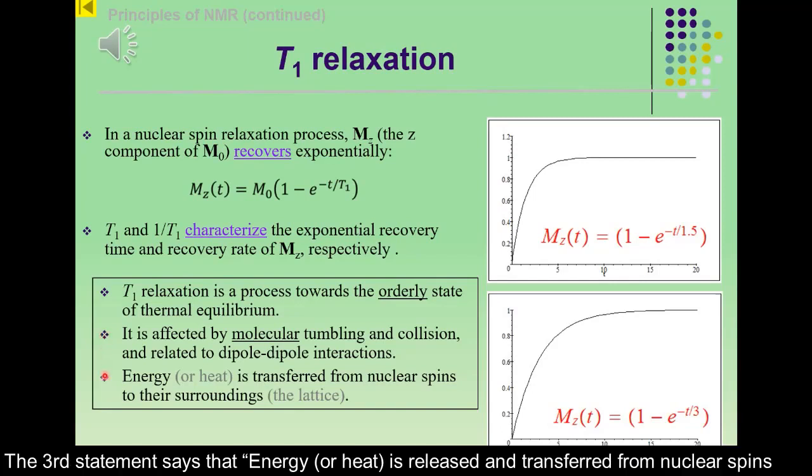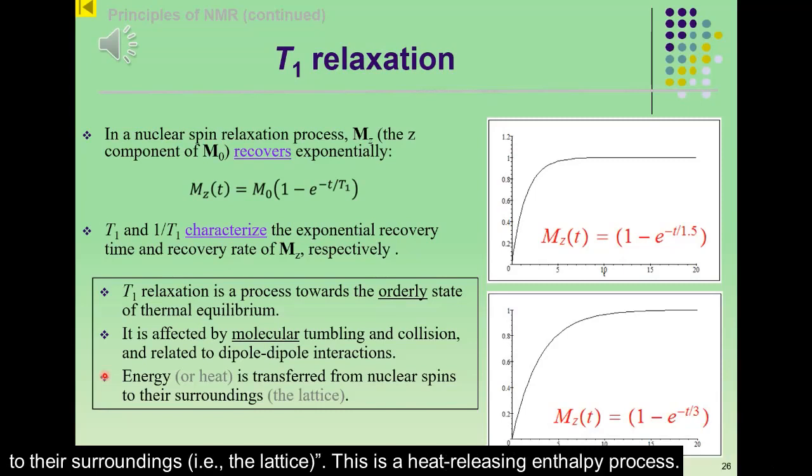The third statement says that energy or heat is released and transferred from nuclear spins to their surroundings, i.e., the lattice. This is a heat-releasing enthalpy process.